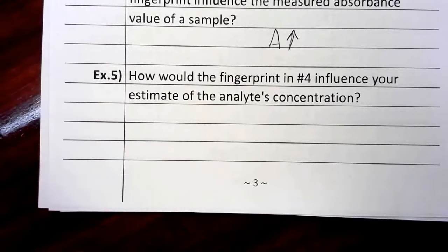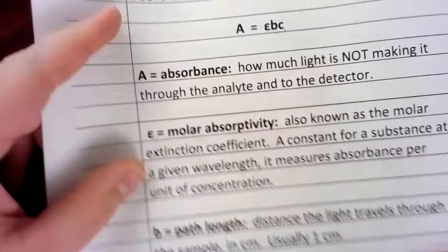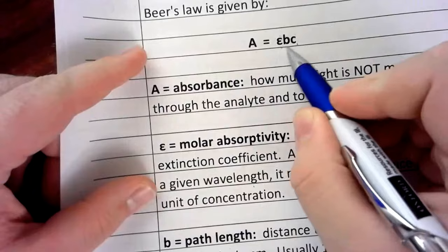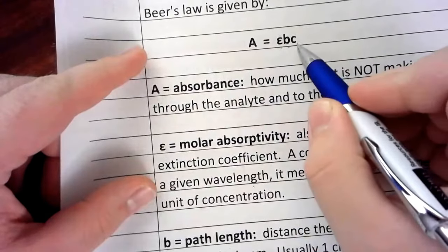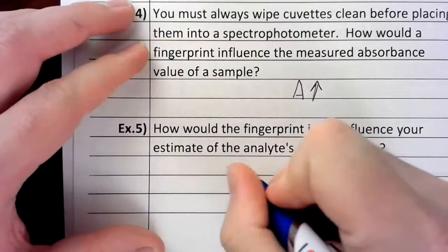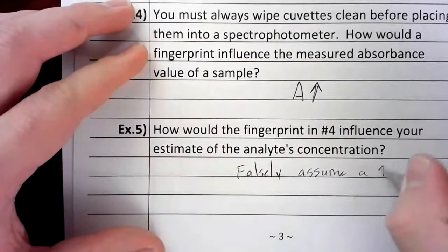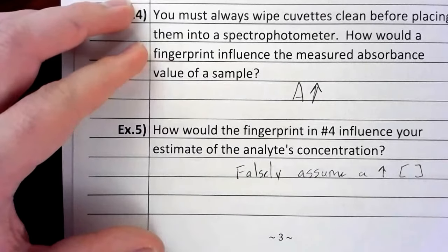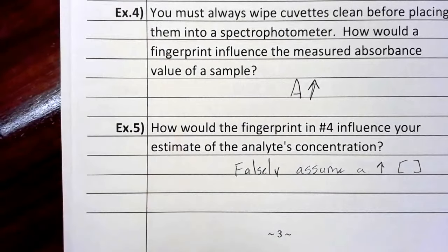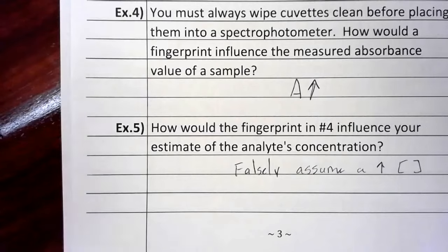So then the question would be, how would this influence your results? Well, if absorbance goes up, remember these two were constants. If absorbance goes up, I would have to assume that so did the concentration. So what would happen is if you had a fingerprint on your cuvette, you would falsely or incorrectly assume a higher concentration. You would assume that the concentration of whatever's in that cuvette is a little higher than it actually was. More light would be blocked by that fingerprint than should have been blocked by just the sample alone. So having a dirty cuvette usually produces results that are falsely high or overly high.